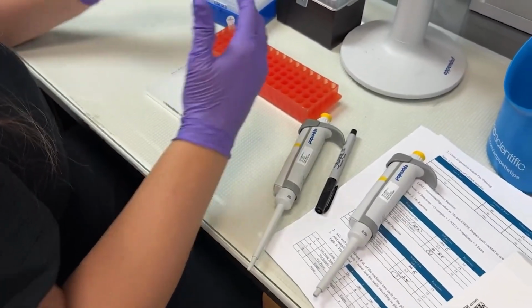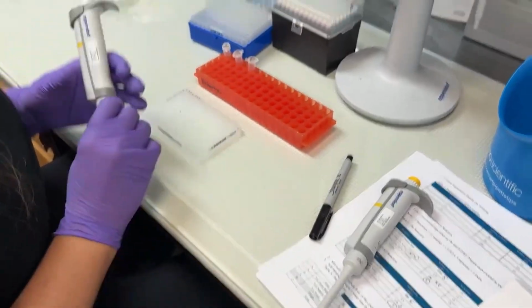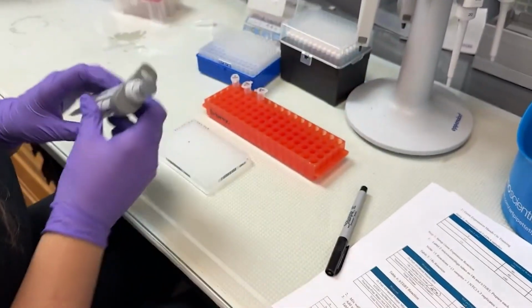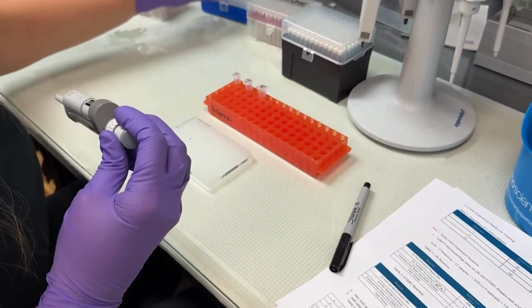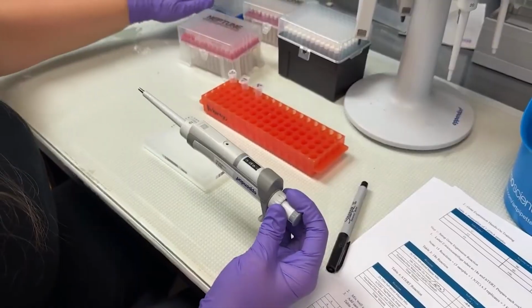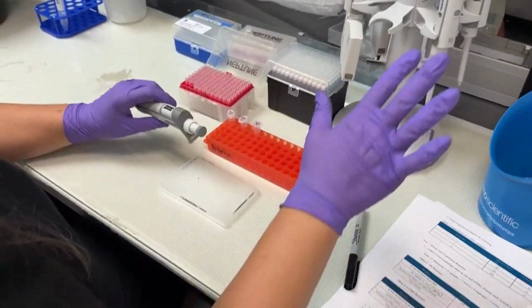Now what's left? Putting sample into that reaction mixture. The way this was set up is I had 8 microliters of my master mix, and now I'm going to add 2 microliters of my sample to each one of the reactions. It's nice to have your workspace organized and easy to use.